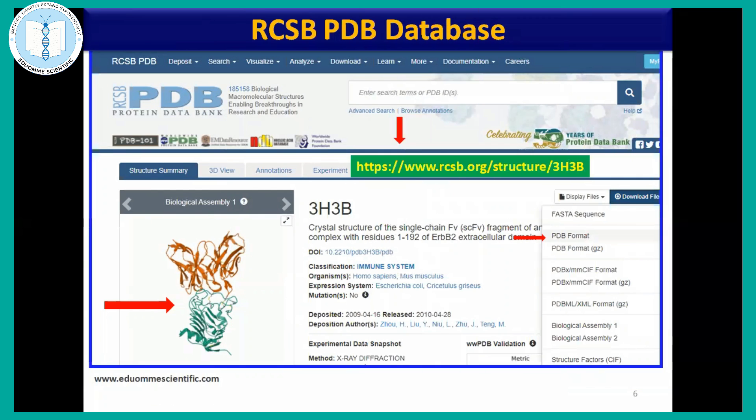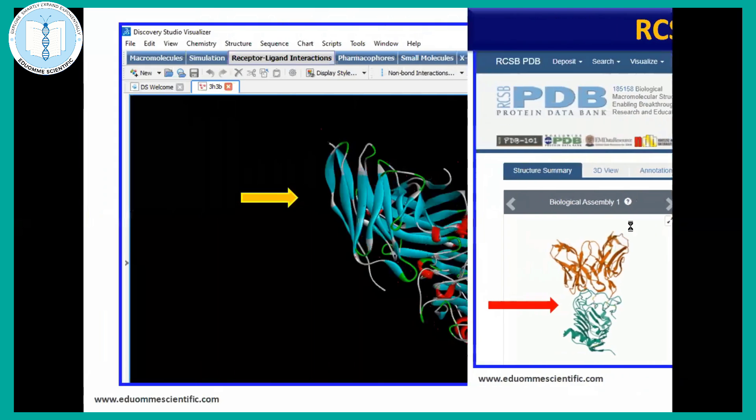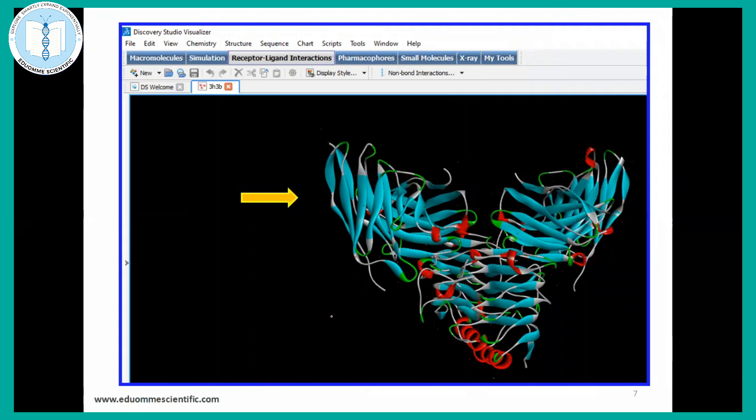If those students and participants who don't have the PDB or structures, they can either get it from the PDB database. It is a very renowned and used database which we use for getting the tertiary structure. You can use this URL, type out whatever search of macromolecule you are doing either by name or if your PDB is known to you, then just type out the four codes of your PDB like I have done for this search.